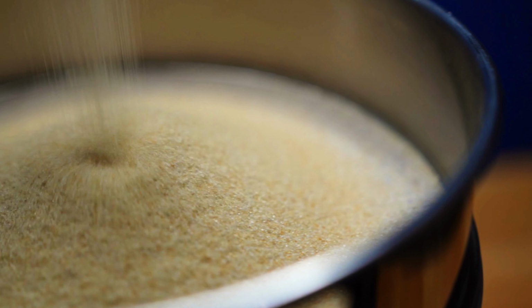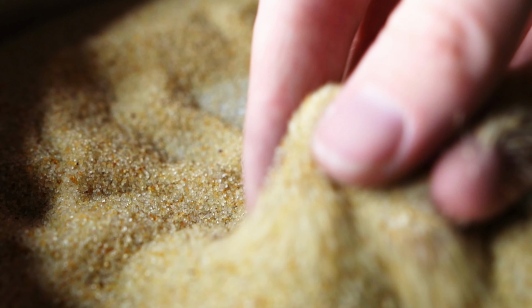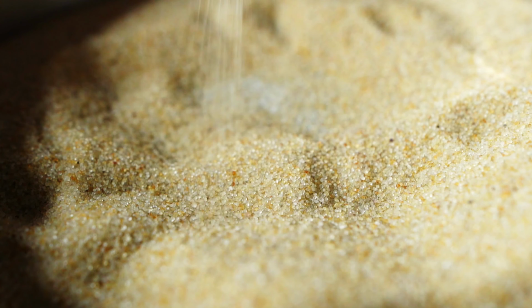The API represents all facets of the natural gas and oil industry. They have a standard regarding the specifications set down for silica sand used in hydraulic fracturing, or fracking. The uniformity of size and shape is critical, including sphericity and circularity. This standard details the different particle size distributions required for each grade of sand, which is verified using test sieves.